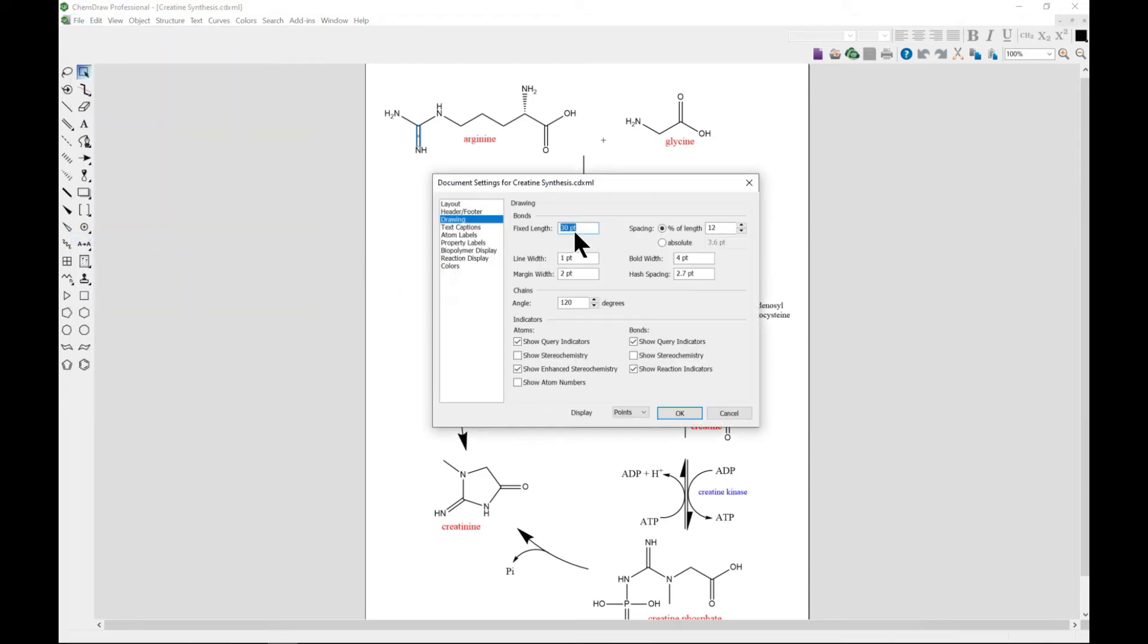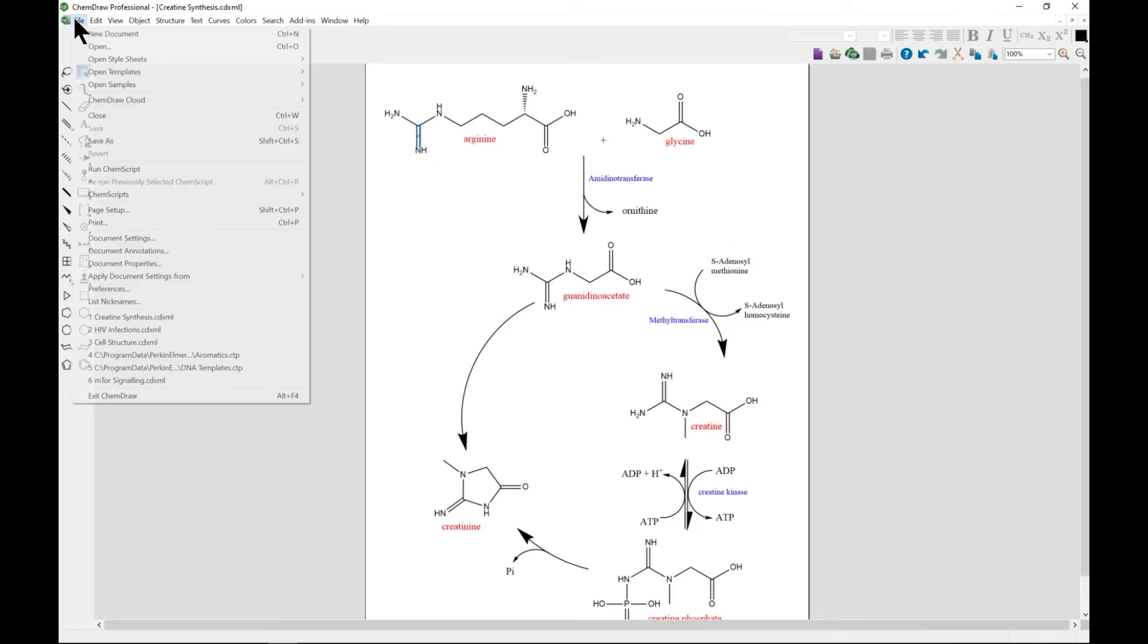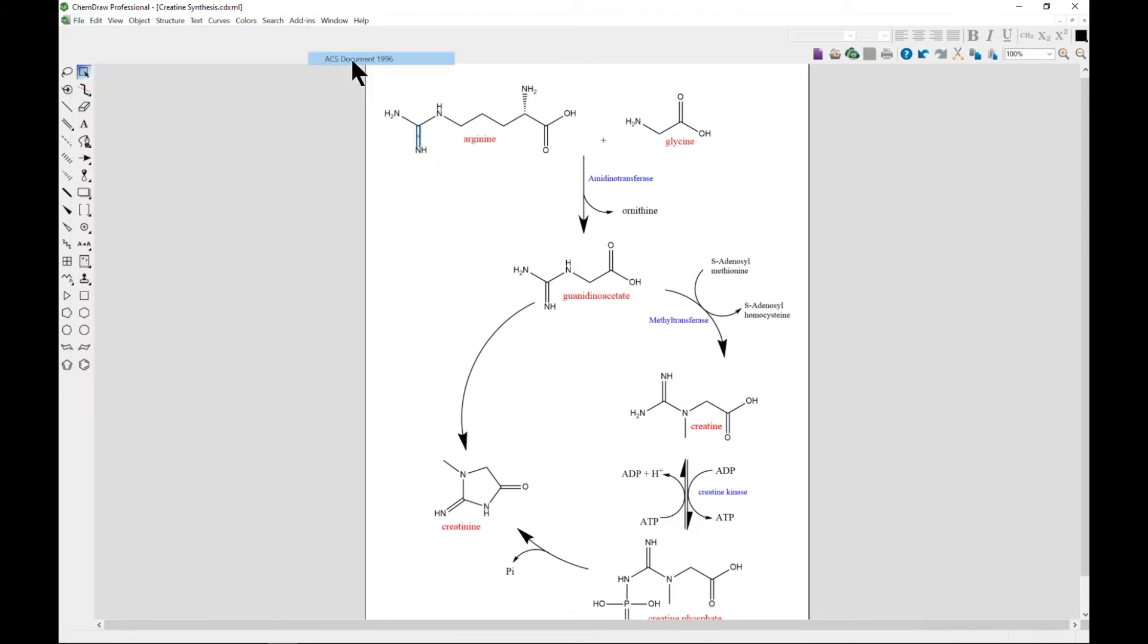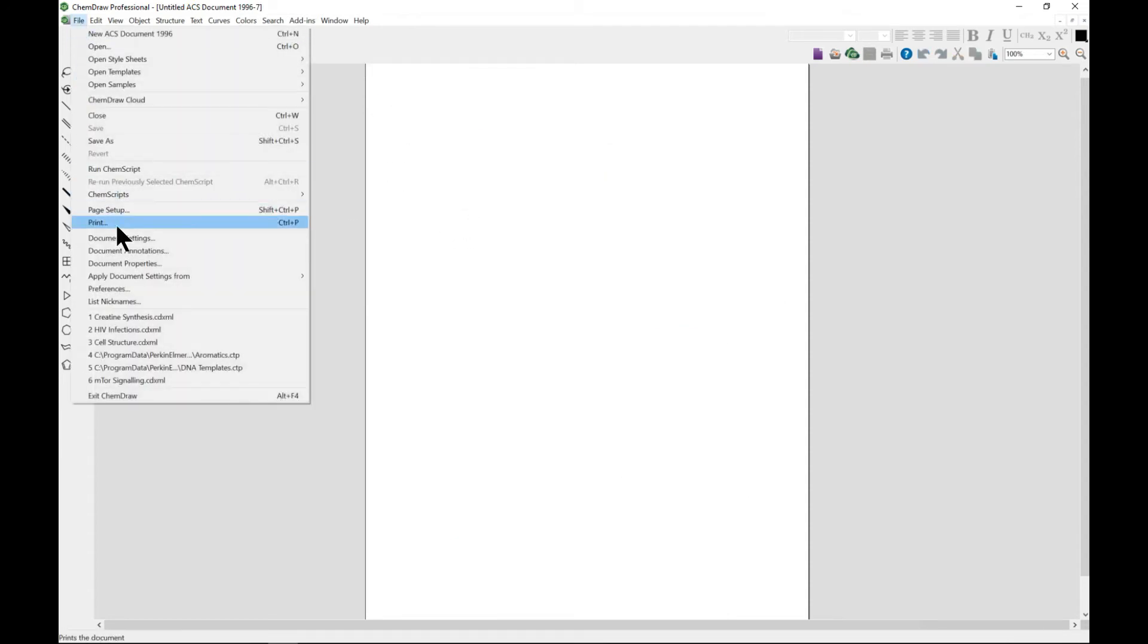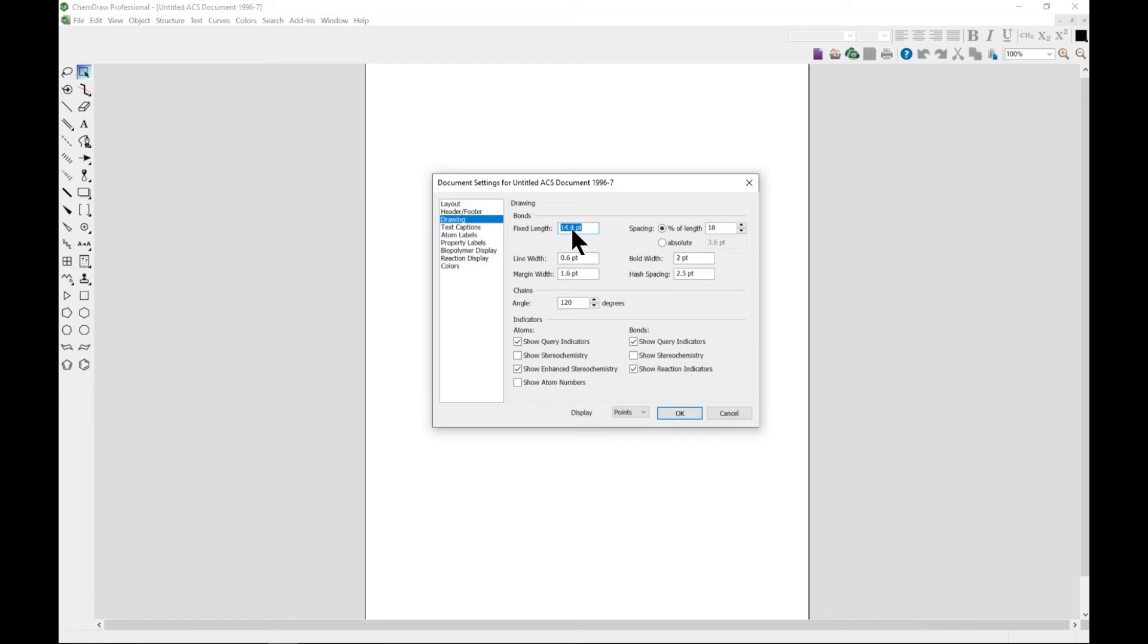Now we see 30.12, so it gives you these points. If we also come to change the style, let's change it to ACS Document and then come to Document Settings.